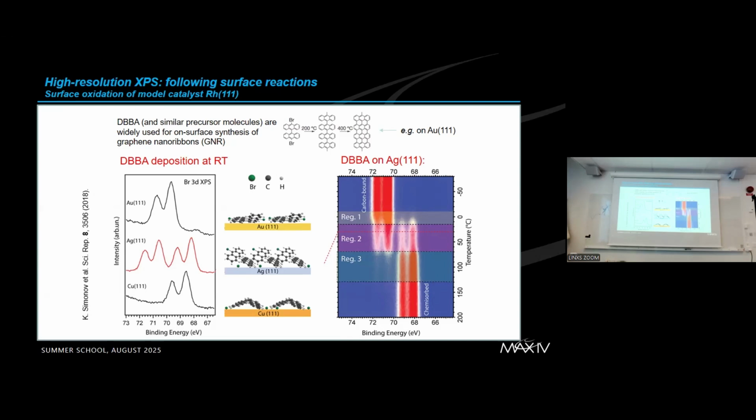Yes. Okay, so for the deconvolution, you have shown there is a possibility of choosing the percentage of Lorentzian and Gaussian. So is there any maximum room for deconvoluting a particular thing? How much percentage Gaussian and how much percentage Lorentzian should there be, or does it depend on the different system?